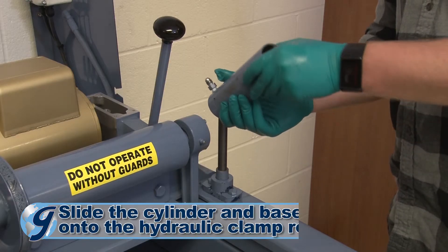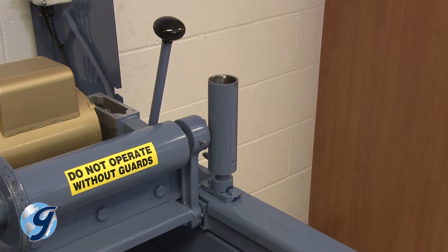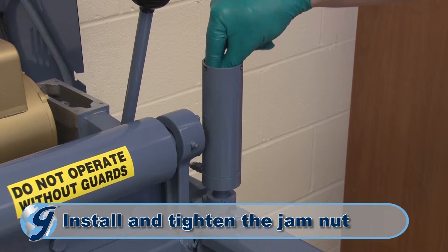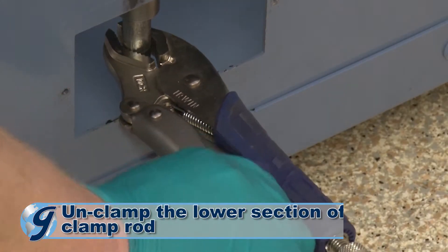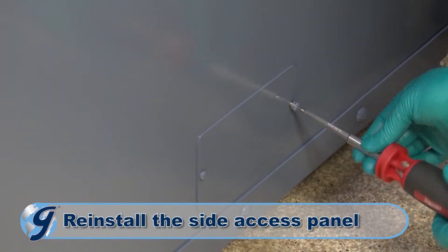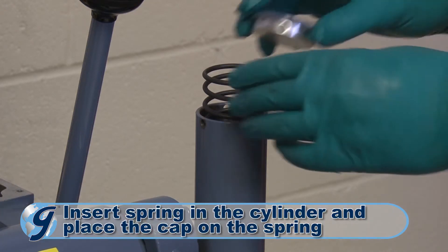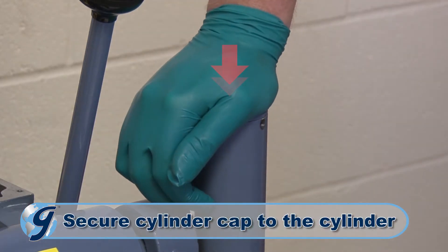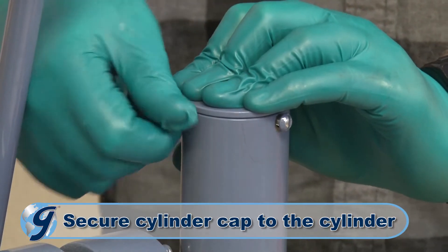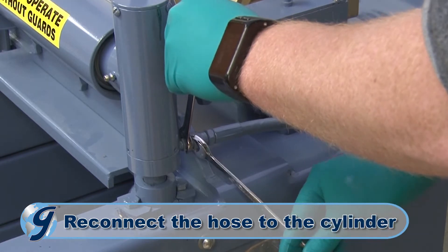Next, reassemble the hydraulic cylinder assembly by sliding the cylinder and base assembly onto the upper end of the hydraulic clamp rod. Install the jam nut and tighten it. Unclamp the lower section of the clamp rod and return the side access panel. Now, insert the spring and place the cap on the spring. Apply downward pressure on the cap as you secure the three cylinder cap screws to the cylinder. Next, reattach the hydraulic hoses.